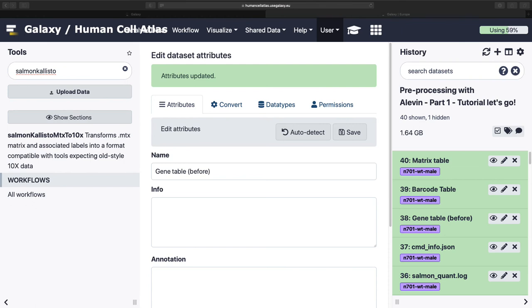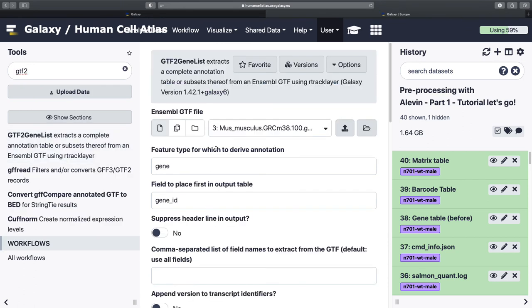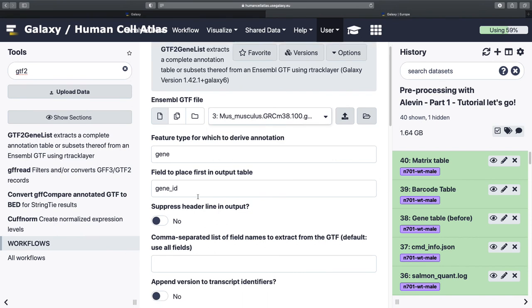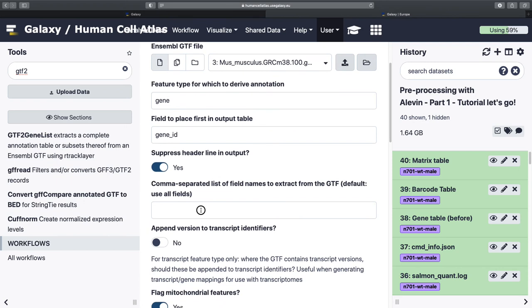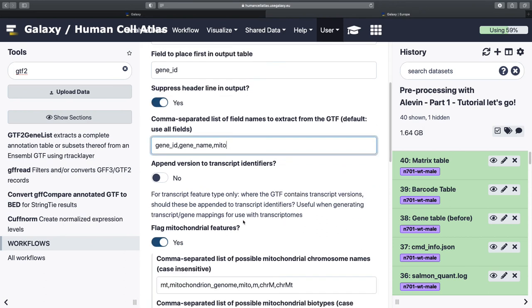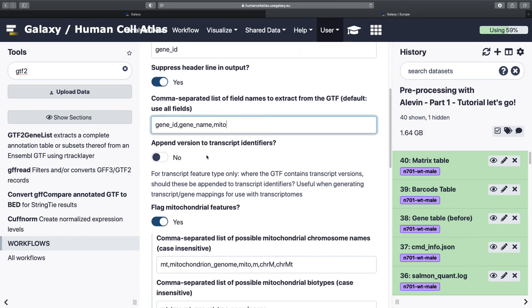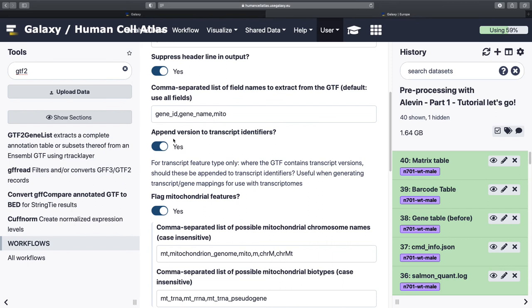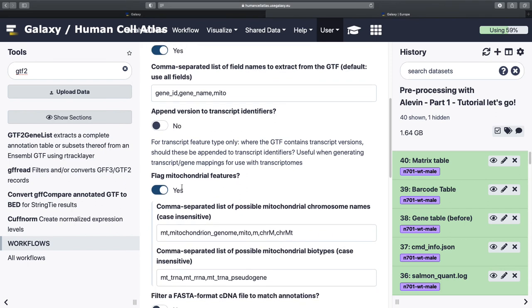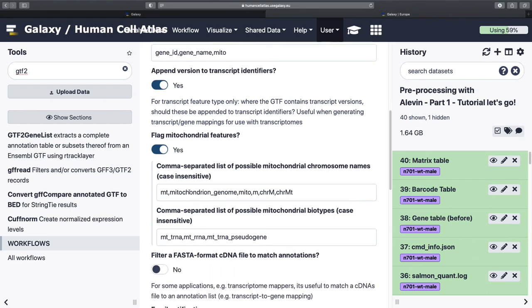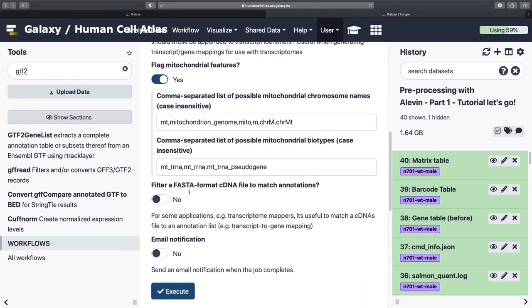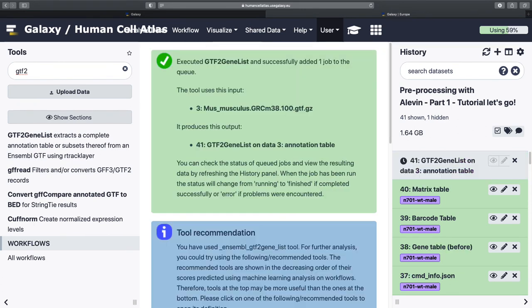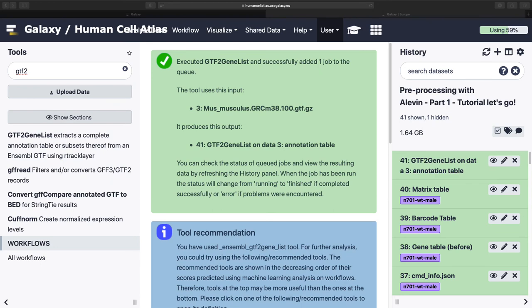So we need to add in a whole bunch of information. And so again, we'll use our favorite GTF file to pull all this information. So we've got gene, gene ID, suppress header. Yes. Cause that's just how the tools work together and how the formats work. And what I want to pull is gene ID, gene name, and whether or not it's mitochondrial. So yes, I want to flag this. That's the one that I want to flag. I'll flag everything. And then we no longer need to filter a FASTA like we did before. And we're there.